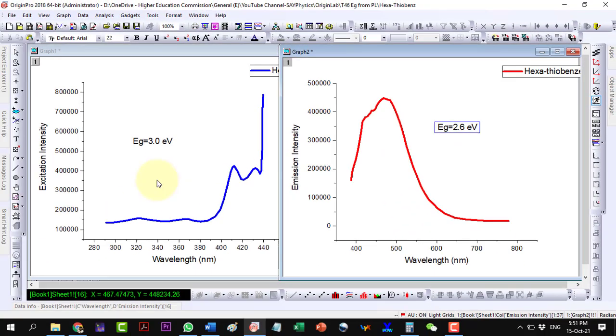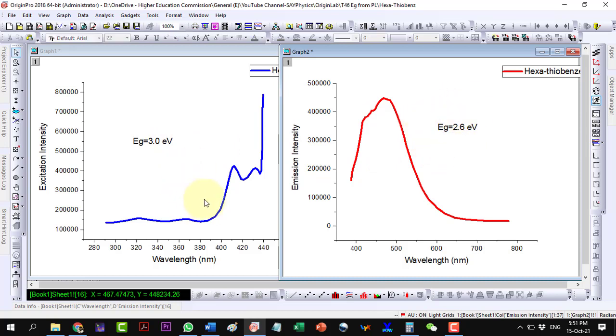If we compare these bandgap values with the bandgap value from the UV-Vis data, the excitation spectrum value is slightly over, while the emission spectrum value is slightly less than the UV-Vis absorption value.